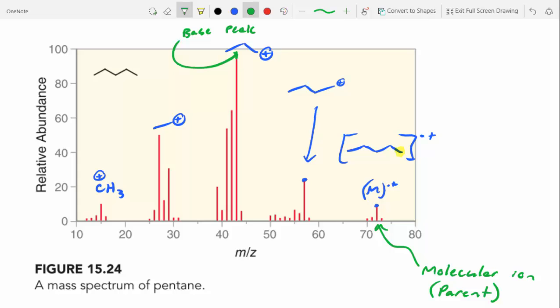Does that make sense? Is that carbon cation in the middle position? I mean, it's always the third one, whether we're from left or right. Yeah, it's usually due to carbocation stability, but whenever there's a tie, it's statistical probability. I'm not going to stress that too much. I just want us to be able to identify the fragment peaks as much as possible.